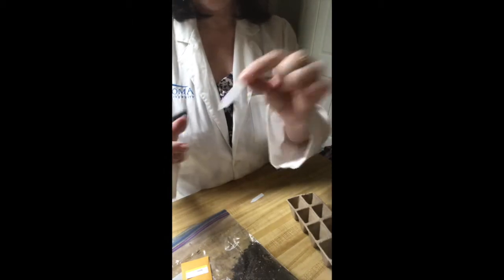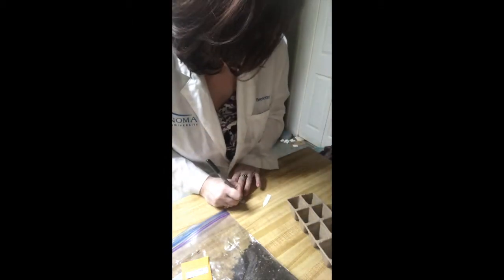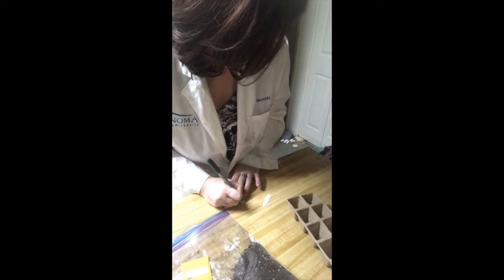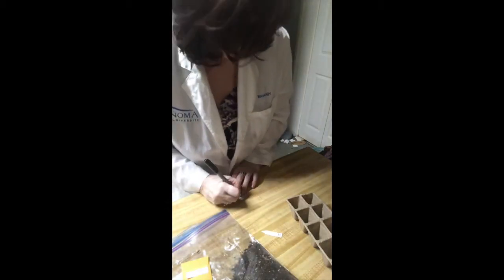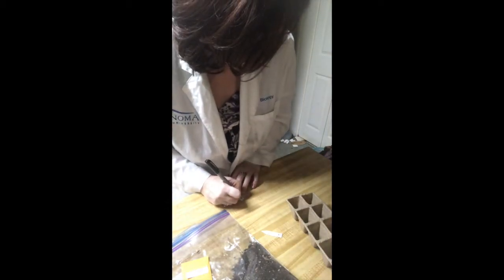Let's start out by labeling our plant markers. On one of them, you're going to write the number one — that's going to be for the side where you've planted enough seeds to grow one plant per pot. On the other side, you will put two, because we'll be growing two plants per pot.